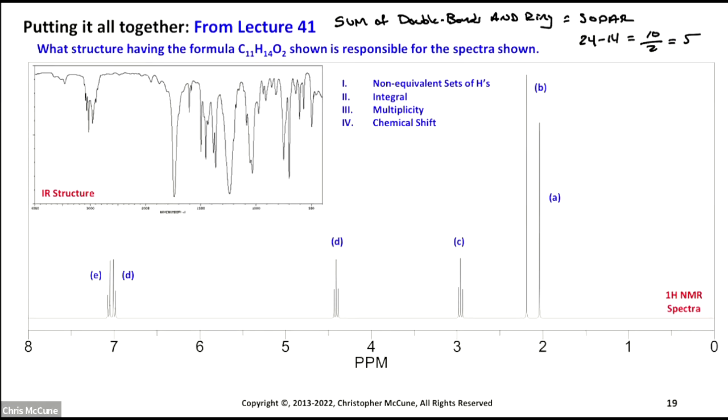You have an aromatic region. So 4 of those most likely are going to be knocked out by this benzene ring, where you're going to have 2 different substituents on the ring, X and Y, and X is not equal to Y. Otherwise you'd have one signal in the NMR. And both of these are doublets. And so that means they're splitting each other. And so that's that piece of the NMR. And now the job is just to figure out what X and Y are.